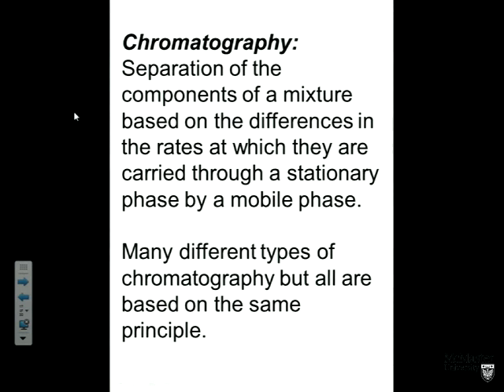It's in fact going to be one of the solvents that we have in our eluotropic elution order. So we're going to have a liquid phase that's going to pass slowly through the column. And molecules of different compounds will adsorb more or less onto the stationary phase, and they will partition between the stationary phase and the mobile phase. That word partition we've used already, right?